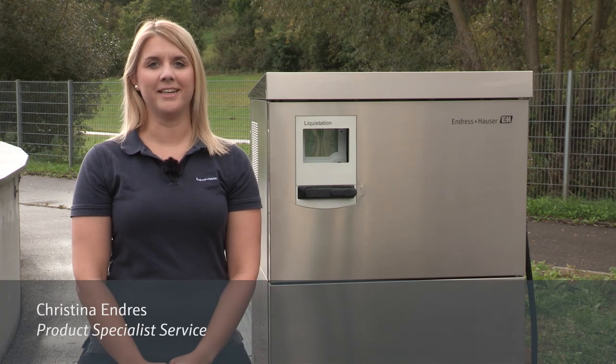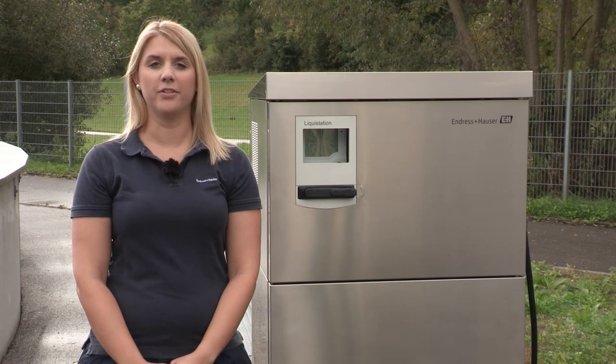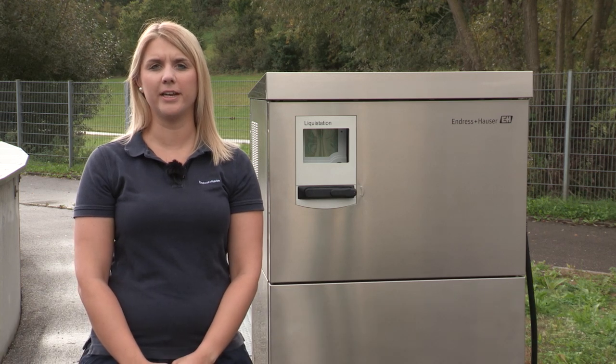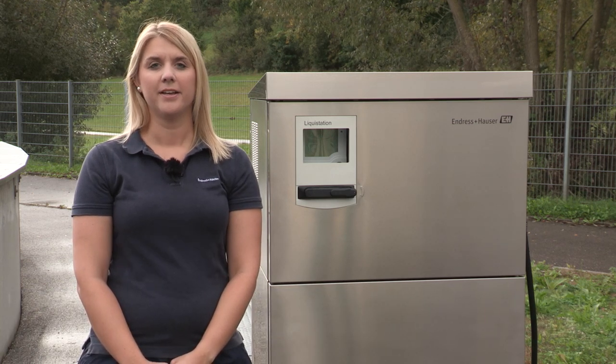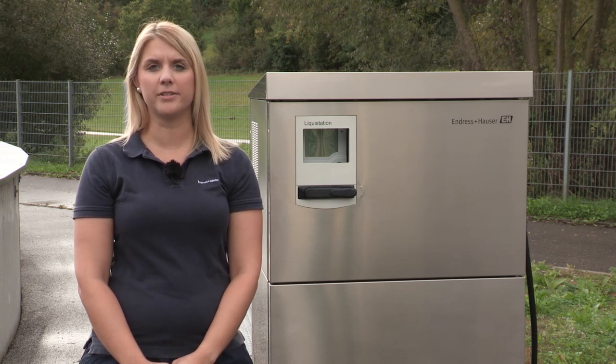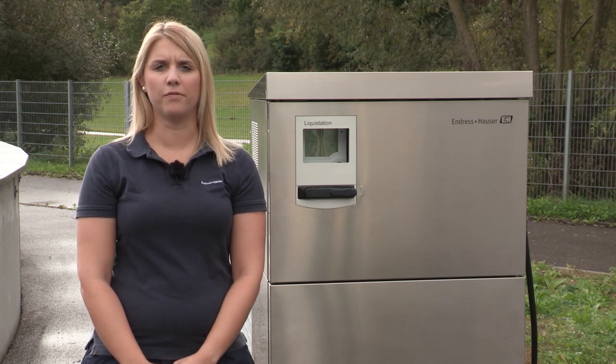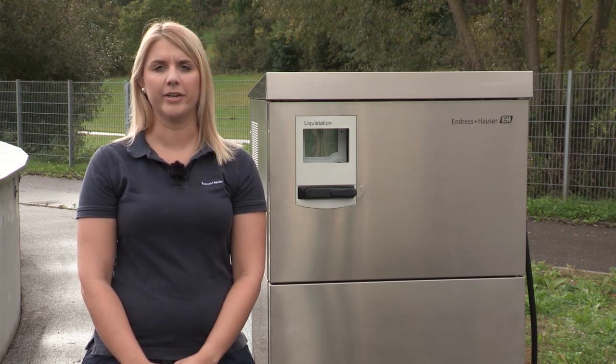Hi, my name is Tina Endres and today I'm going to show you how to perform a commissioning on the LiquiStation CSF48 peristaltic system. The CSF48 is our reliable and easy to use stationary water sampler for time controlled, volume or flow proportional and event triggered sampling.